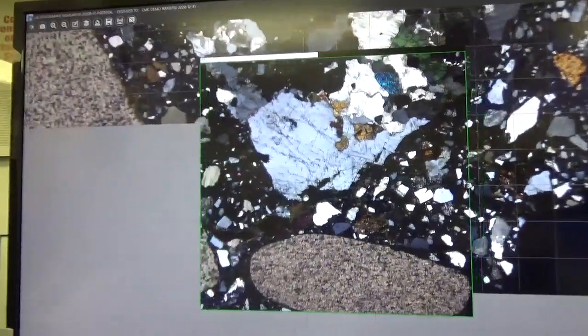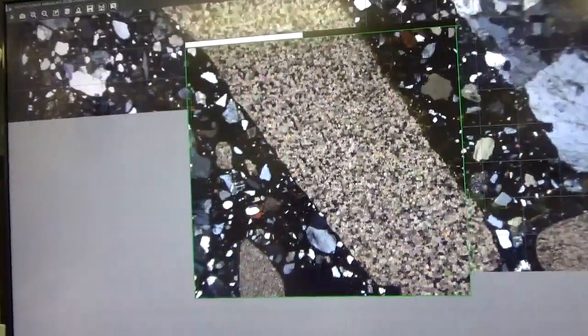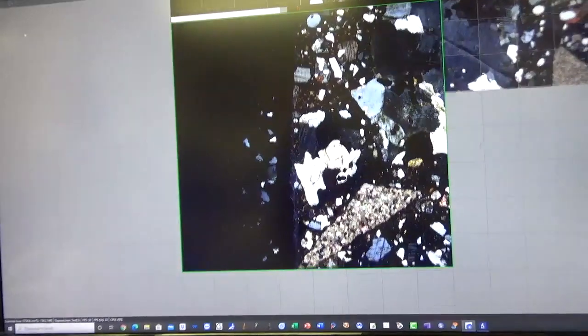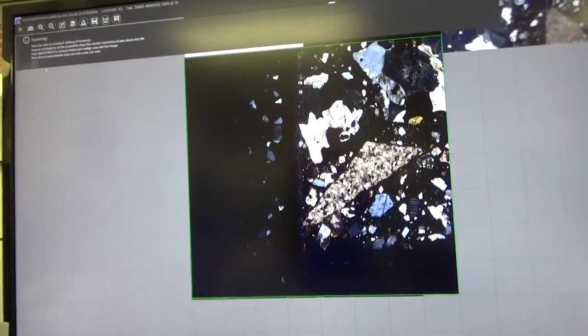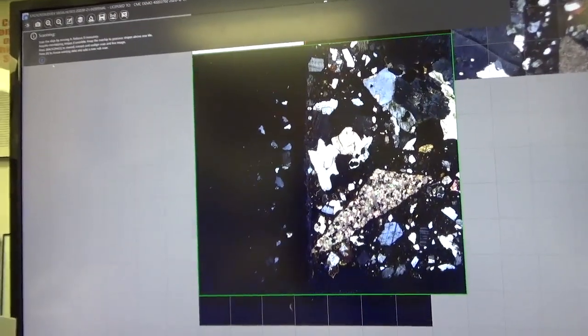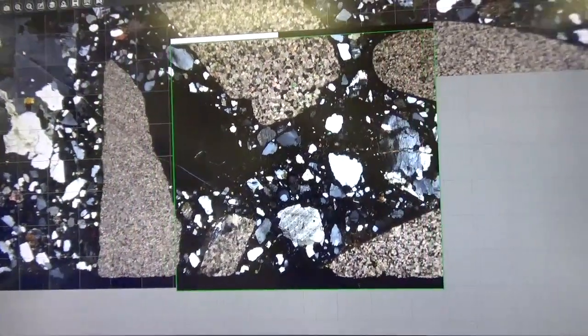And again, this speed is fine. 5-6 minutes is all it takes. No need to go faster, or you end up with an image with blurry patches here and there. You don't want image blur. This is done, but I still want to stay a little higher. So I have about 20% overlap, and I will make another run at the end.